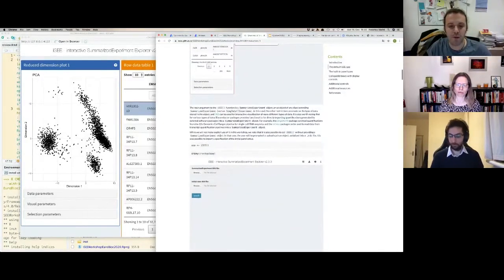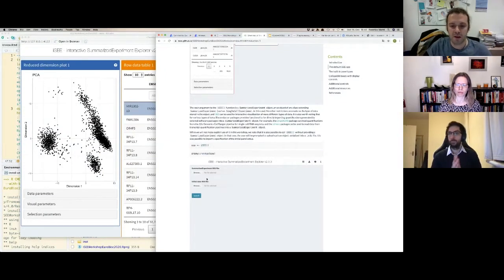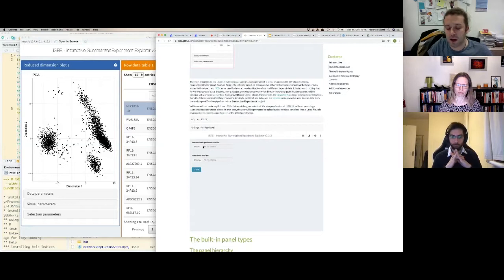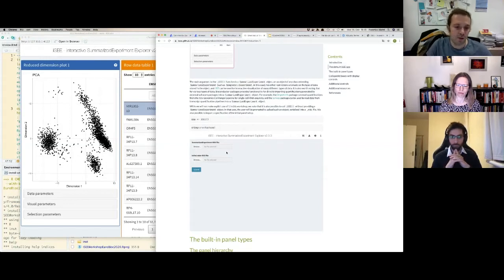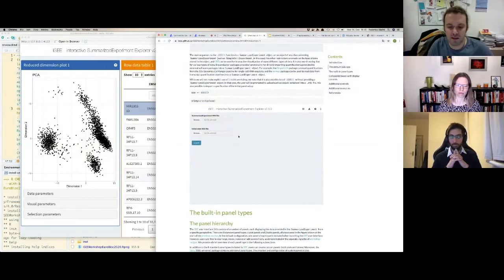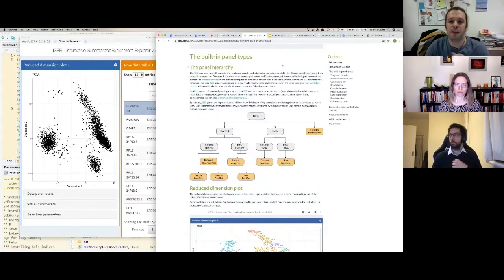You can also run iSEE as a hub-like resource by calling `iSEE()` with empty parentheses, which allows you to upload a SummarizedExperiment object as an RDS file and the app will automatically update. It will open any dataset you upload; the main limitation is file size. If running on a server or locally you may need to tweak the maximum dataset size setting.